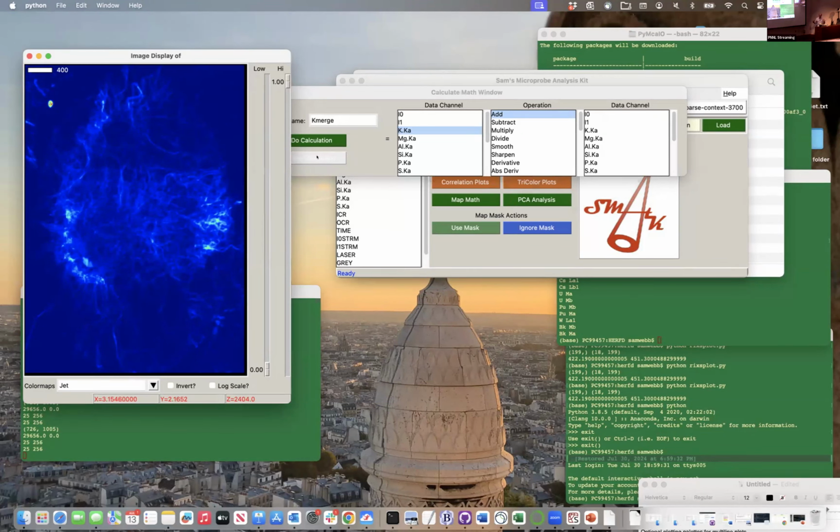So this is simple because this is now same beamline, same sample, different resolutions. We can do this with different beamlines across SSRL. And now we're going to try to do this with multiple modes of other data sets. So this is where the fun part will come in, right? Any questions on anything that's been shown so far?